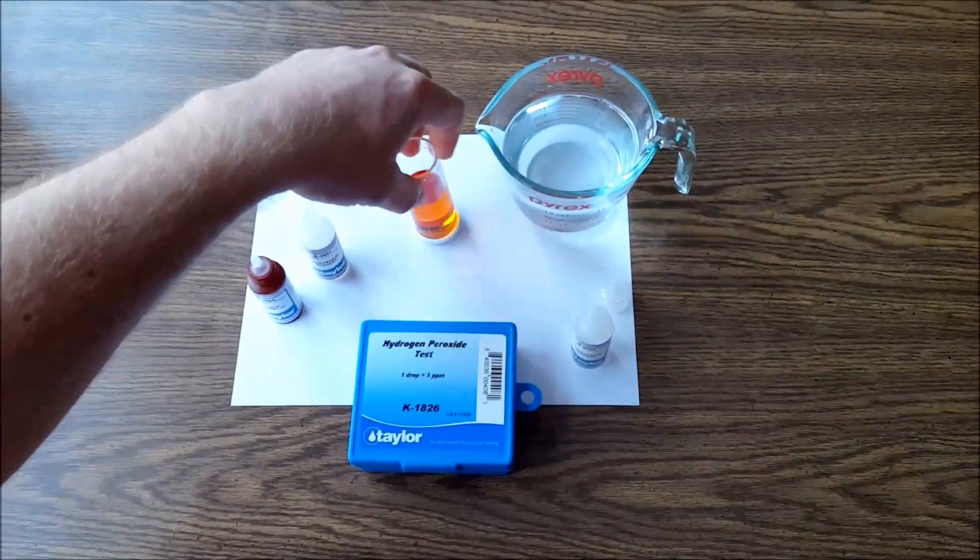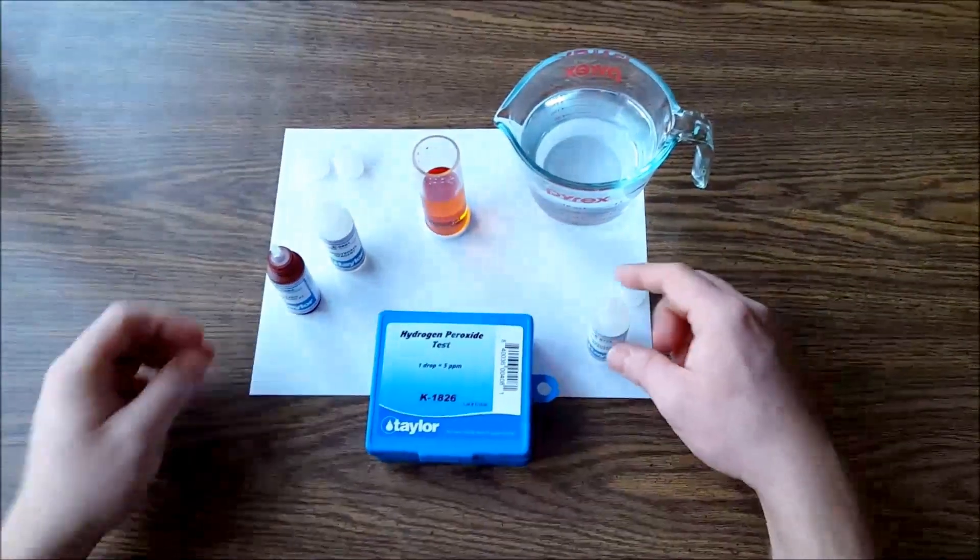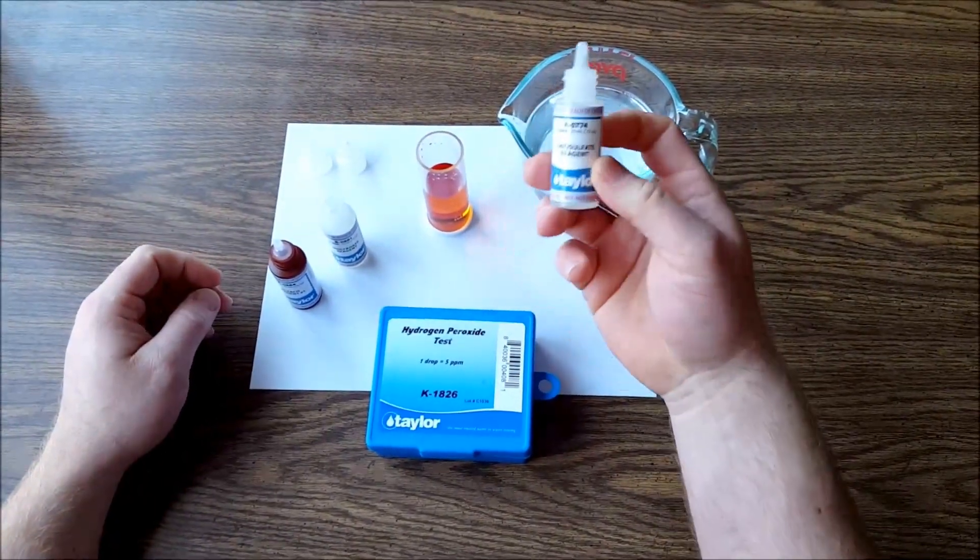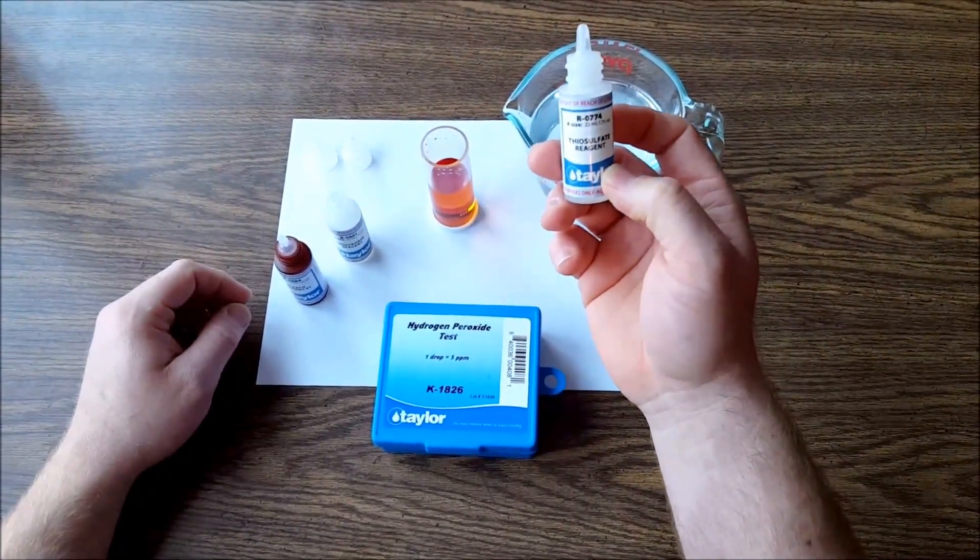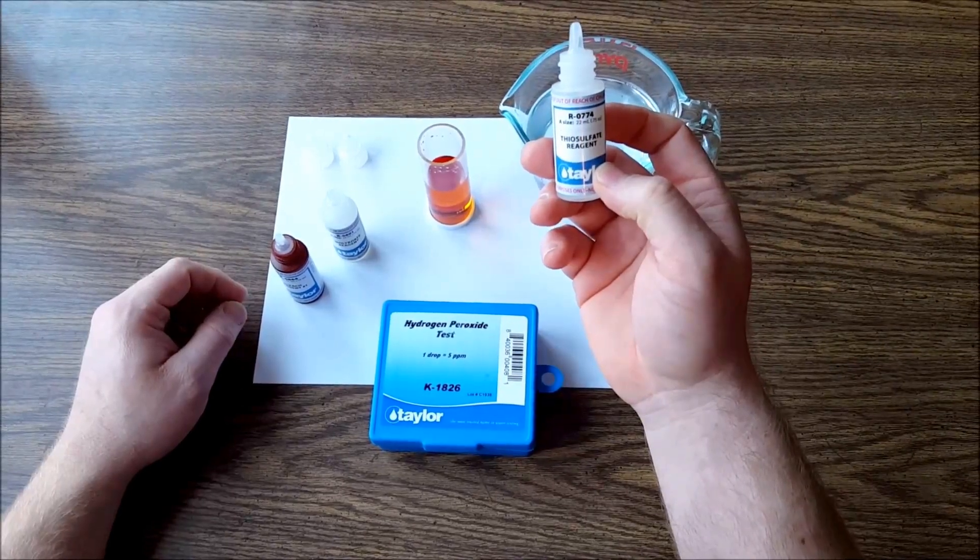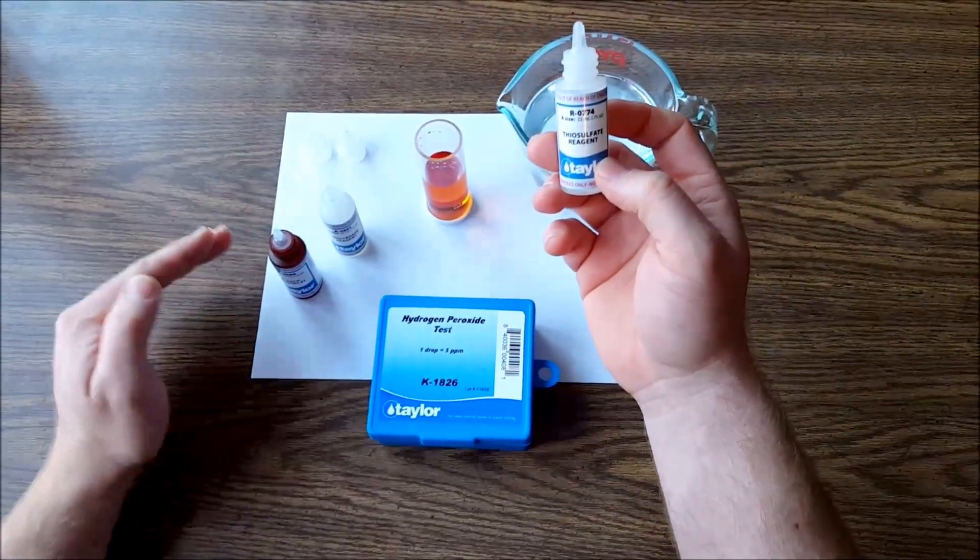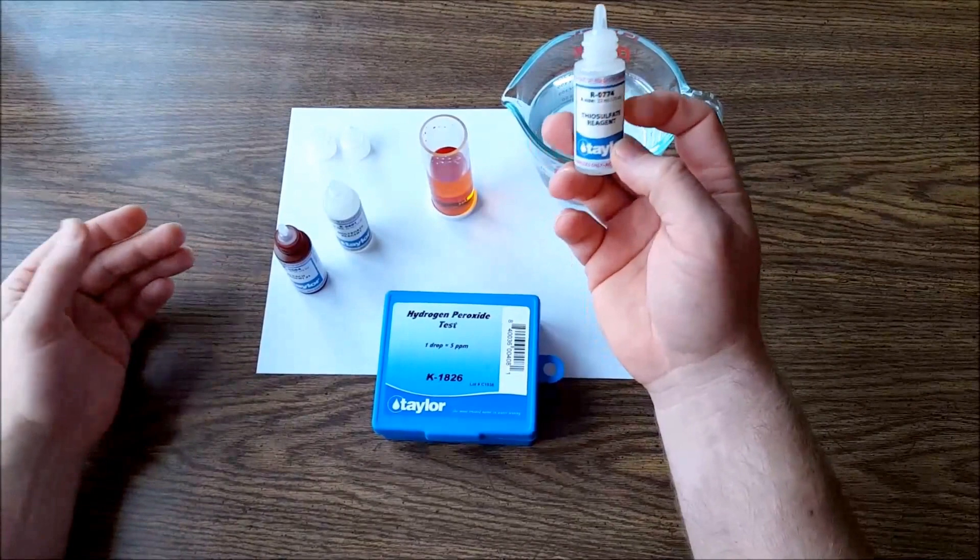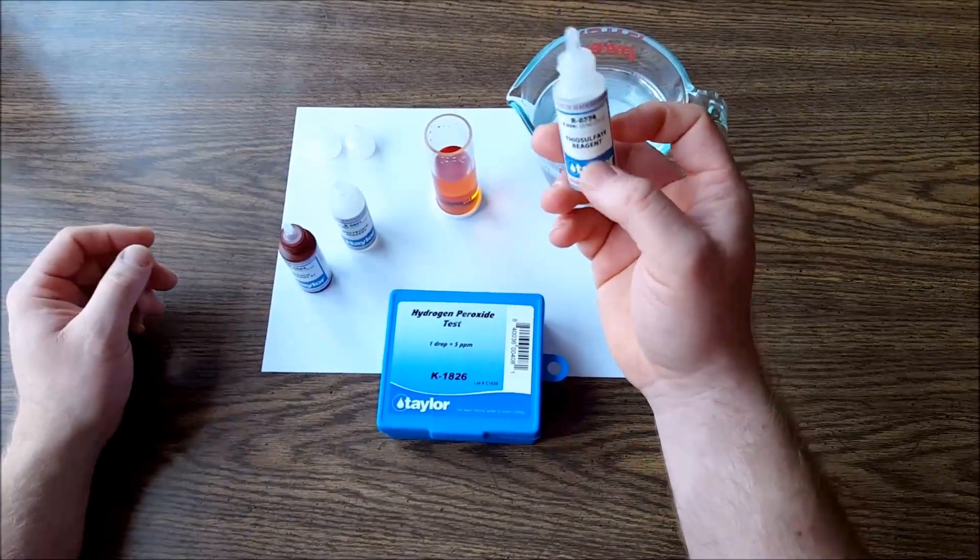And that's how you can go to the last step, which is to add your thiosulfate reagent. And how this works is for every drop of thiosulfate reagent that you put inside of it, it's gonna equal 5 parts per million. So if I was to put 10 drops of this in there, that would equal 50 parts per million.